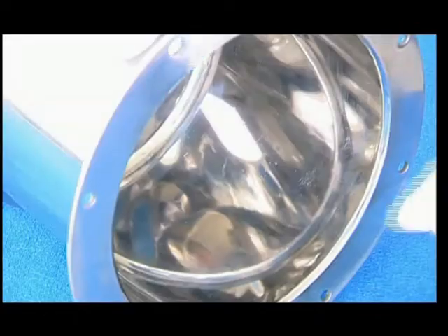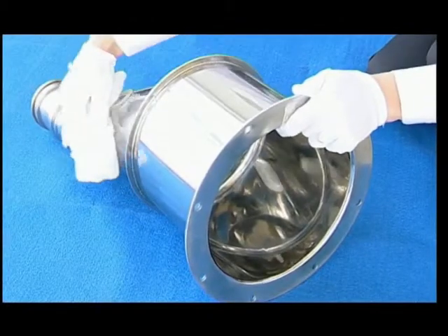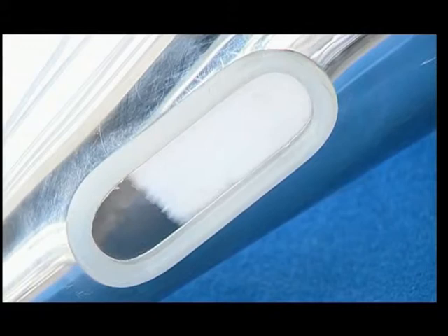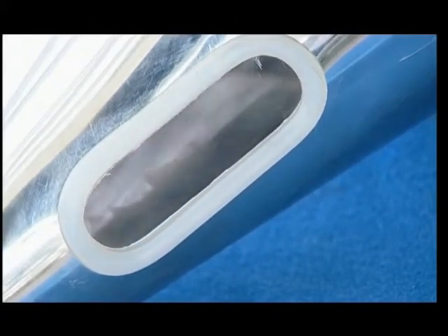Cleaning the hopper. First, unload the hoppers and then clean the cover with a scouring pad. Finally, clean the inside cover and dead angle with medicinal alcohol. It should be covered by clean plastic for installation.